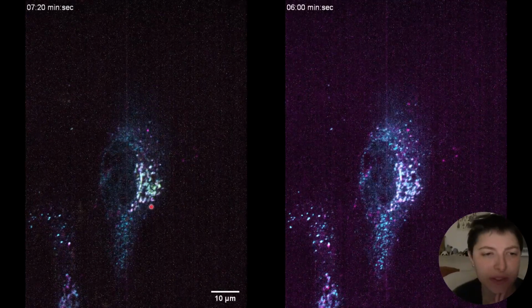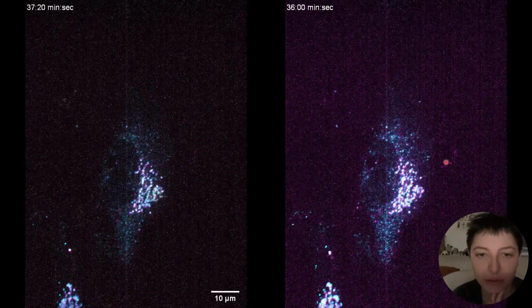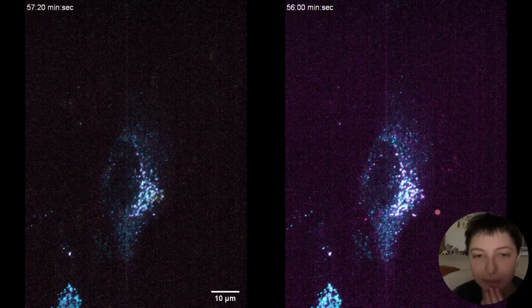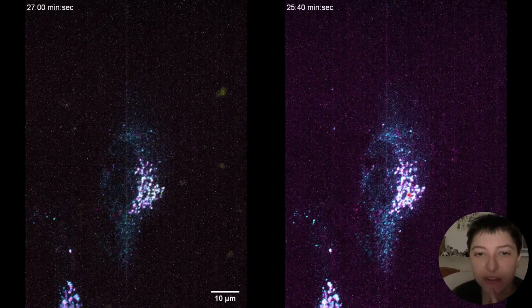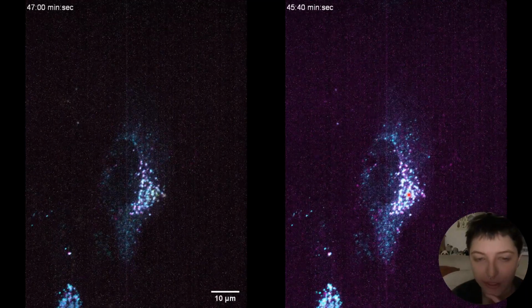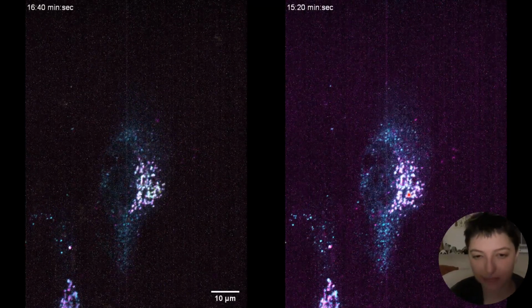Yeah, for this one, the Golgi's in green here. I think this one doesn't have the Golgi marker, but I thought it was interesting how the ER exit sites... The marker that we used, the halo thing, doesn't actually mark the ER exit site specifically.